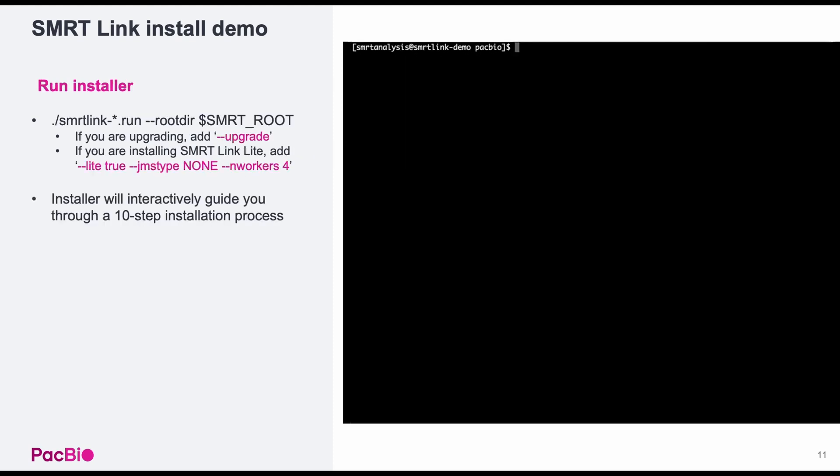All that's left is to run the installer, which will interactively guide you through the installation process. A couple of notes before I run the command. If you're upgrading SmartLink, you need to add --upgrade. If you're installing SmartLink Lite, add lite=true, jms type=none, and in workers=4. All right, let's go through the installation process.